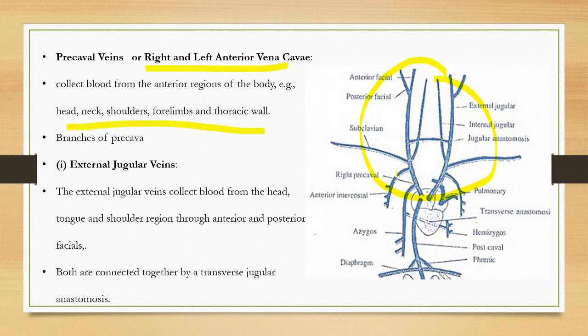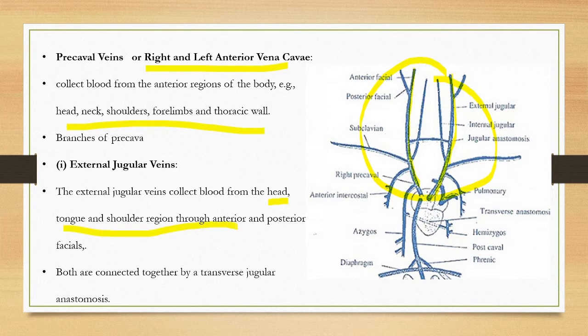The branches of the precaval include the external jugular vein. This is the right precaval vein and this is the left precaval. The first branch is the external jugular vein. The external jugular vein collects blood from the head region, neck, and shoulder region through anterior and posterior facial veins.